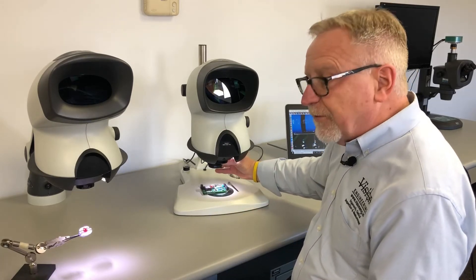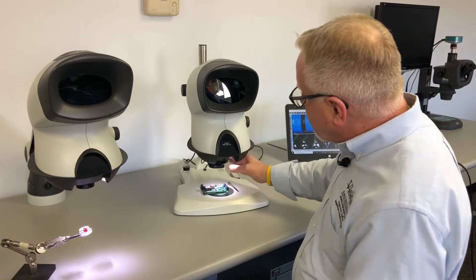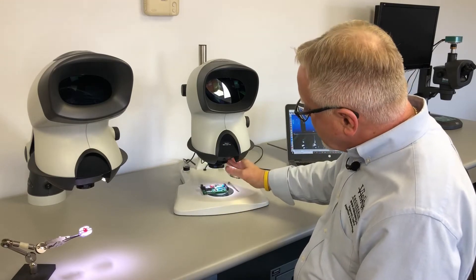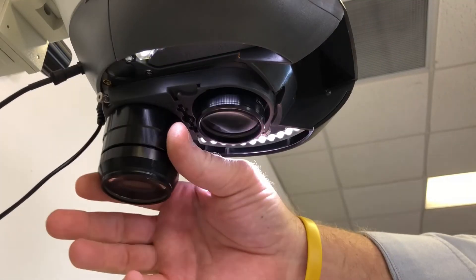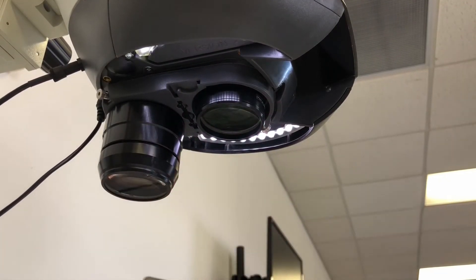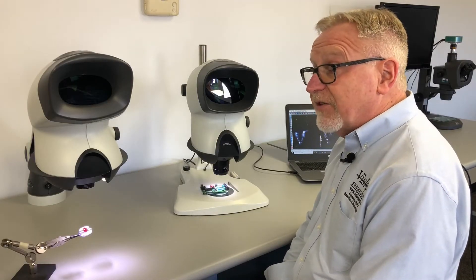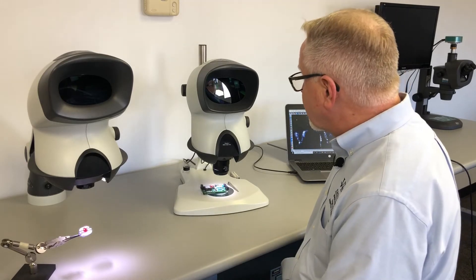In this instance, we have a 4x and a 10x in there, so at 4x we have great working distance and a large field of view to the scope of about an inch. We can easily take that and flip it right up to 10x magnification. 4x and 8x or 4x and 10x are by far the most popular choices with the Mantis Elite.